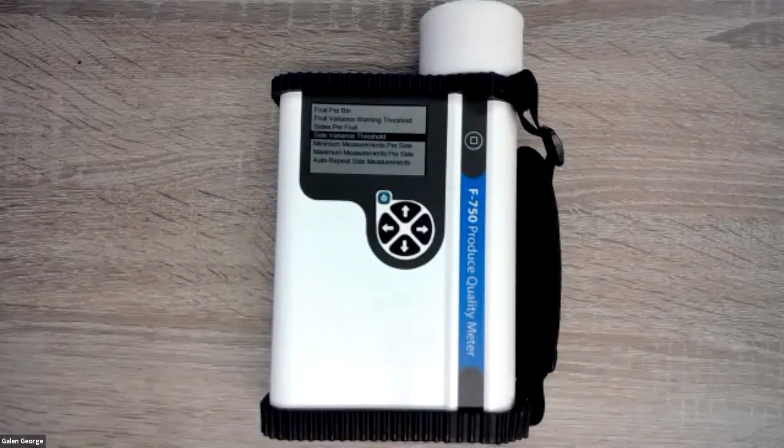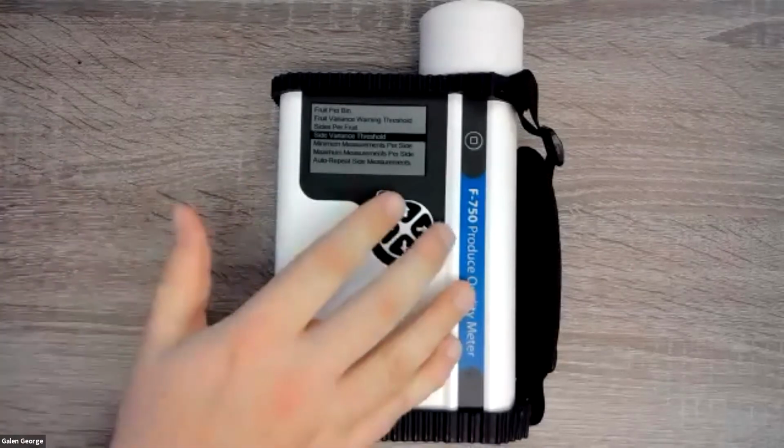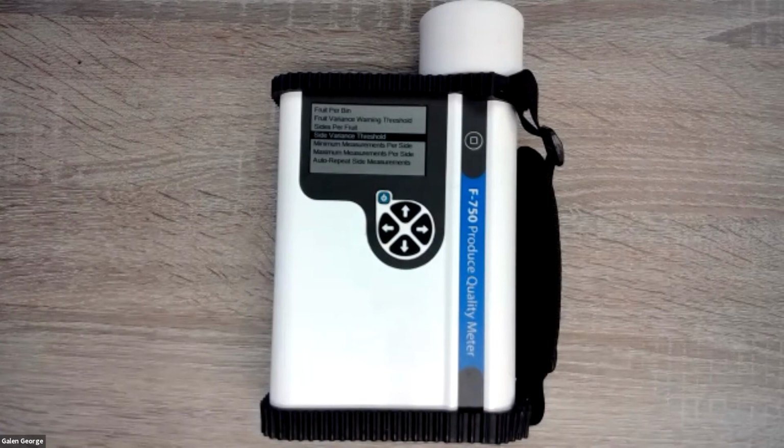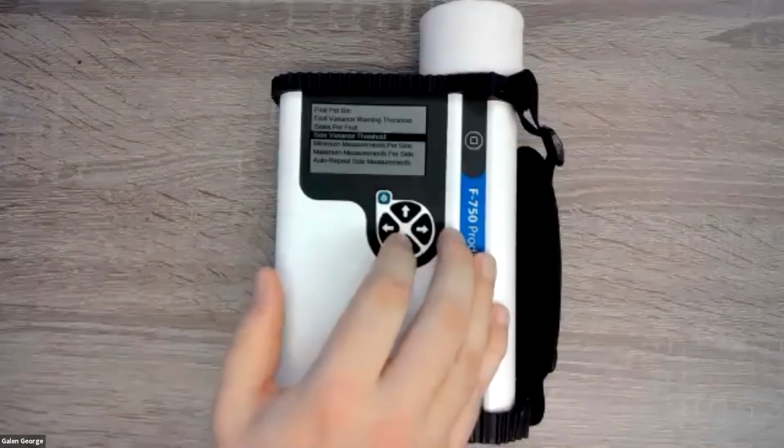So between 2 sides, for instance, if I measured the dorsal side and it was 25% dry matter, and then I measured the ventral and it was 32%, I could have a warning set up with a certain threshold value that would then prompt me before I could continue to say, do you want to rescan that? Maybe something went wrong during that scan. Do you want to just make sure that that scan was correct? So that's a very useful tool to have.